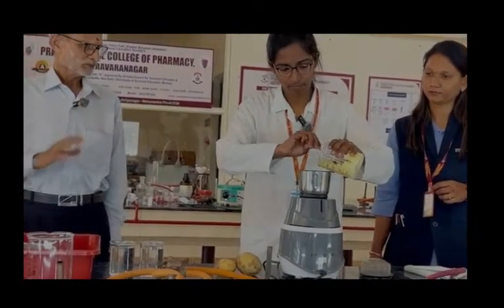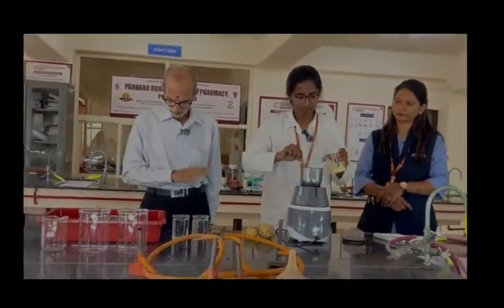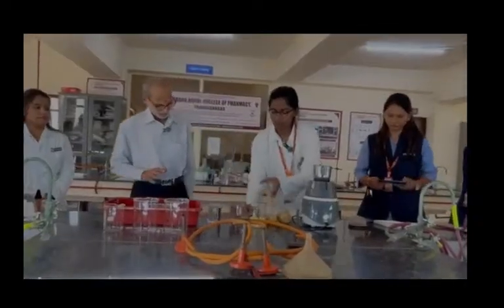Okay, so now what we are going to do, we are going to make a pulp out of it, pass it through, do it fast. So if you look at it, add more starch, water.